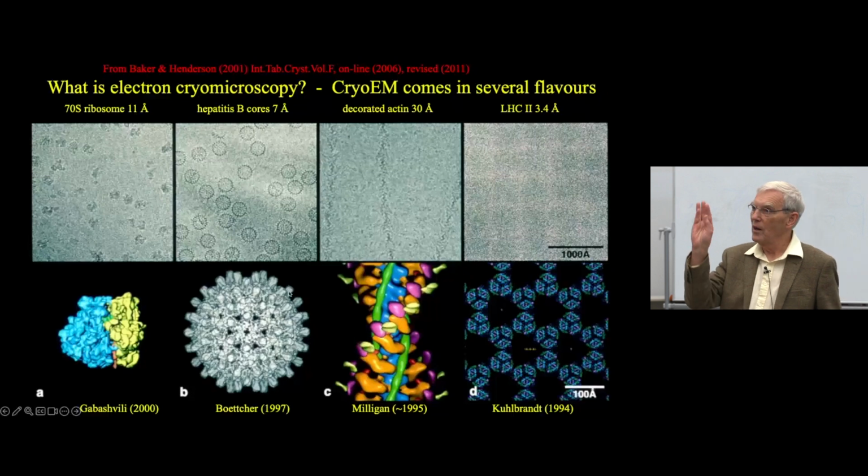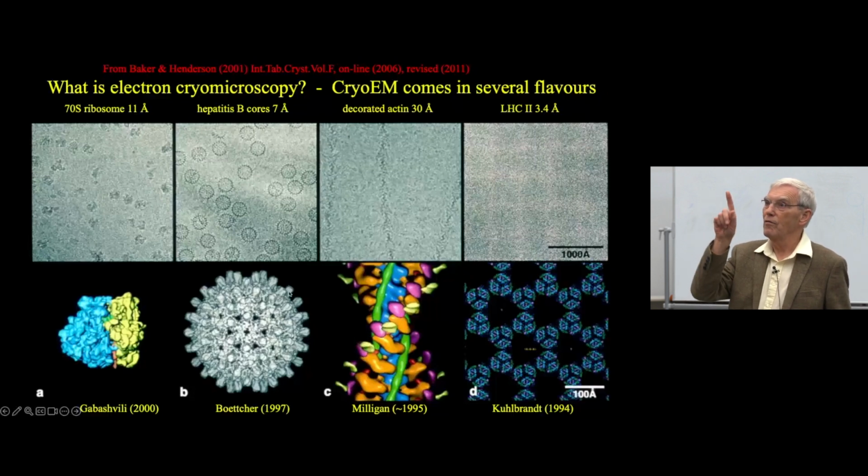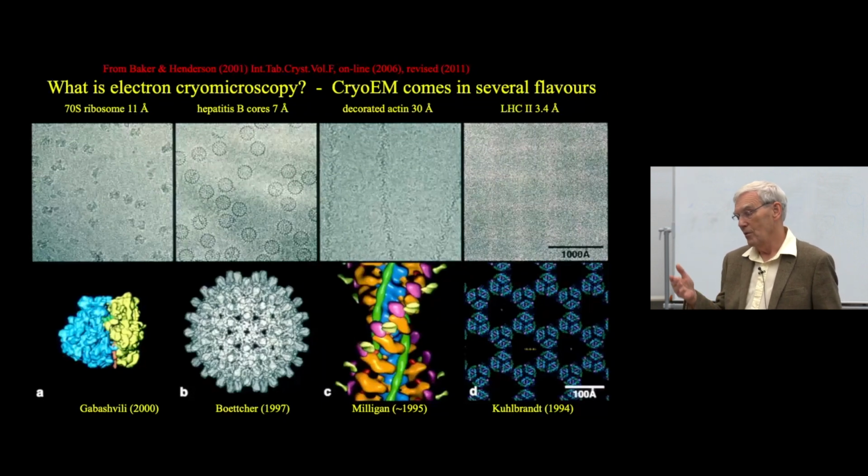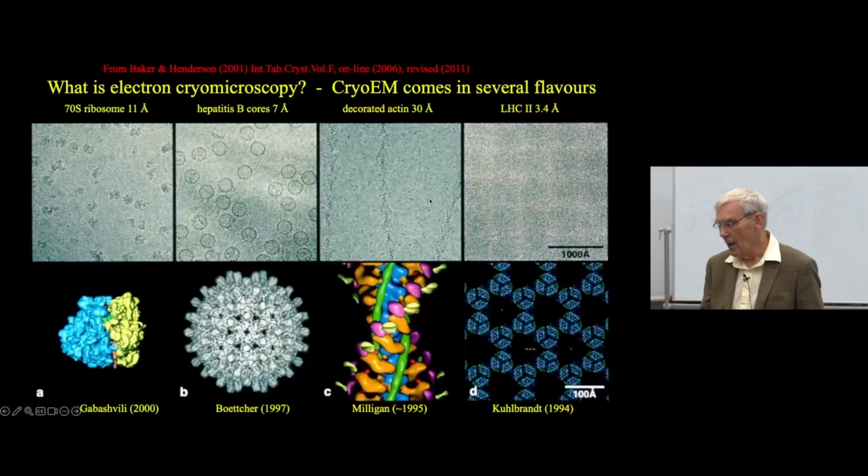And each of those protrusions is a bundle of 4 of Pauling's alpha helices sticking out from the surface, and they even built a model using their knowledge from the sequence and from labeling at that stage. So that was the first, if you like, an atomic model made by single particle electron cryo-microscopy of a biological structure. And then the other 2 have higher levels of organization.